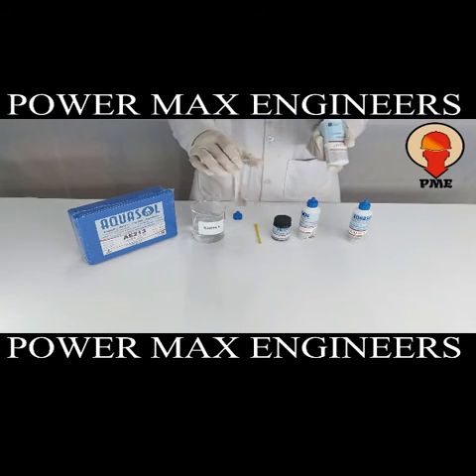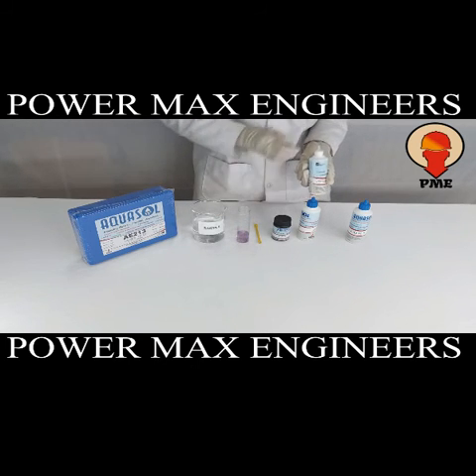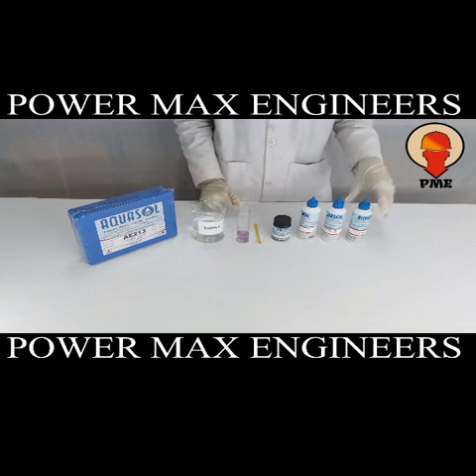The number of drops of CD3L2 reagent multiplied by 2 is the chloride level of the sample in ppm. If the sample has more than 40 ppm of chloride, repeat the same procedure using the CD3L5 reagent instead.